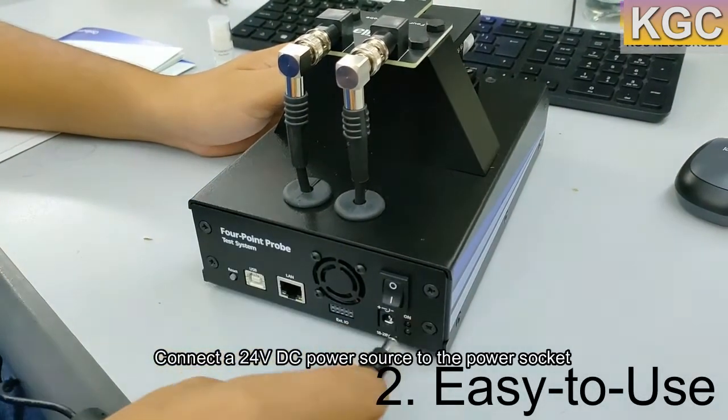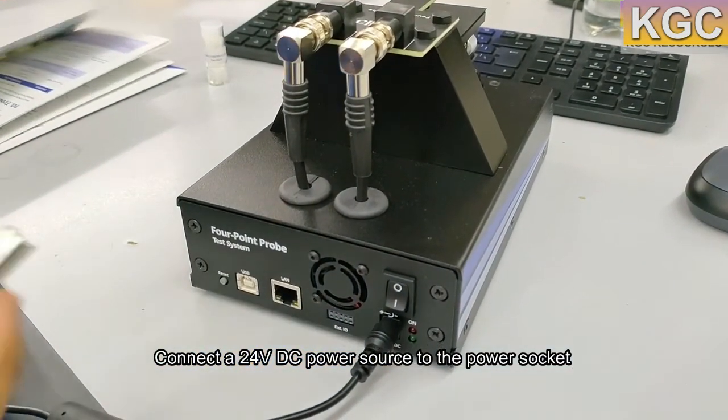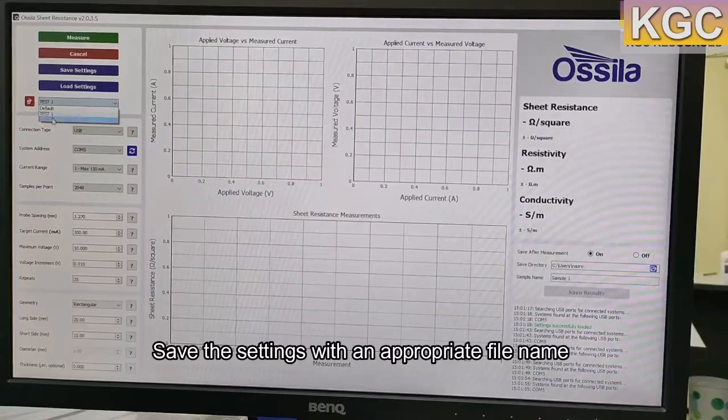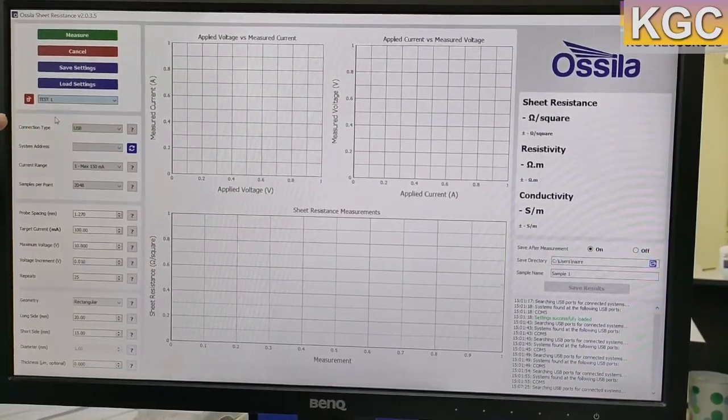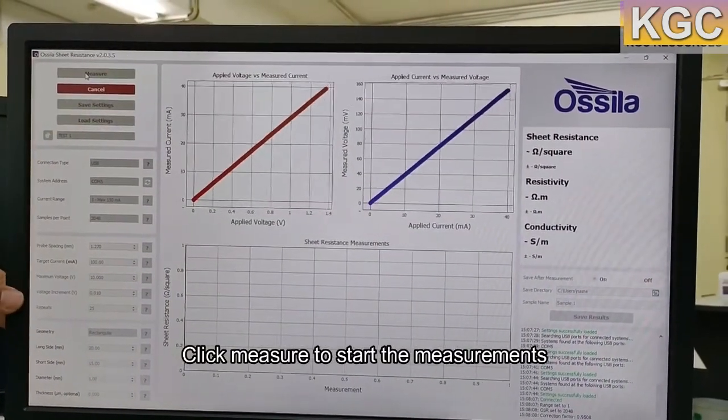2. Easy to use. Just plug in the system, install the software, and you're ready to go. The intuitive interface and clean design makes the 4-point probe easy to use, simplifying the measurement of sheet resistance. Substrates of various shapes and sizes can be used.